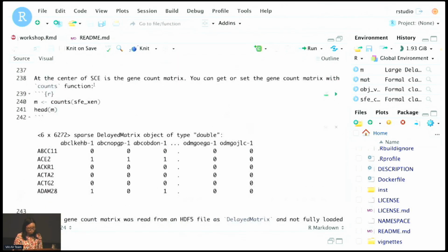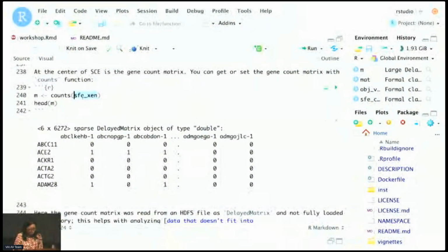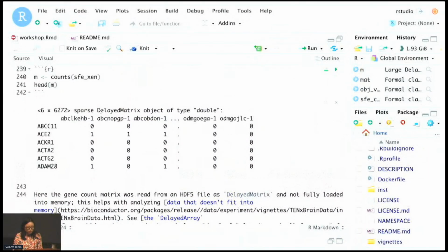In SCE we have the gene count matrix, and the raw counts, like the raw UMI or molecule counts, can be gotten or set with the counts getter or setter. Here this is the Xenium data, and this is what the raw counts matrix looks like.